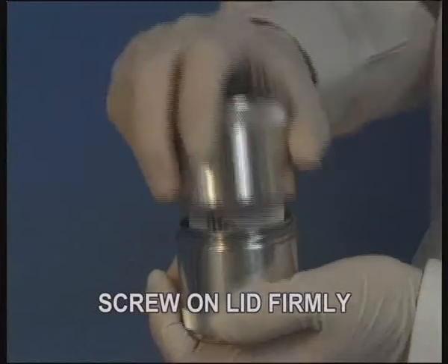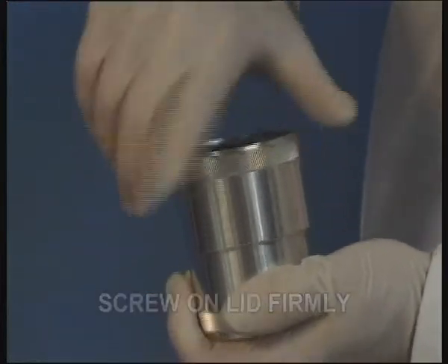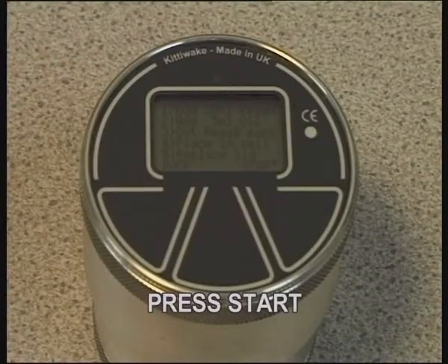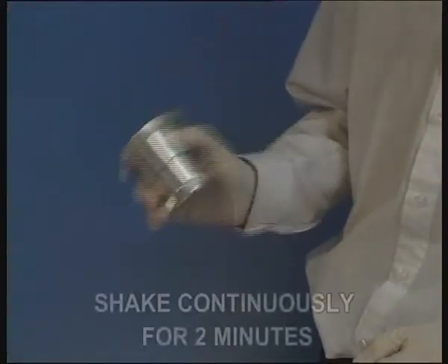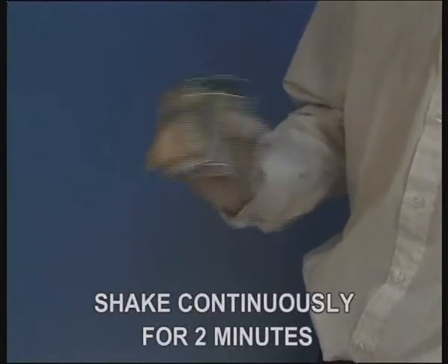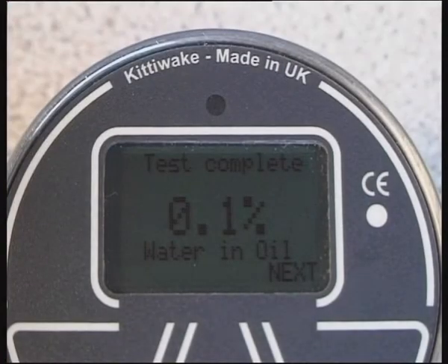Firmly replace the cell lid. Press the start button. Shake the cell for two minutes, during which time a graph will be plotted and your results displayed on completion.